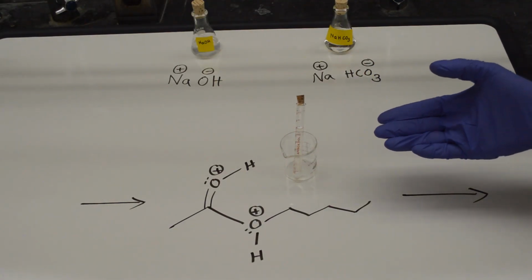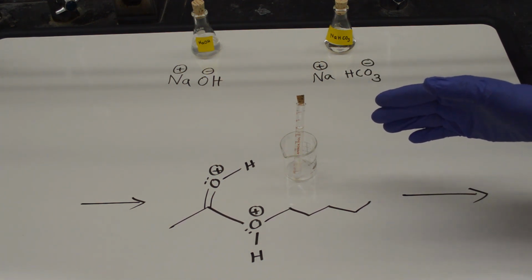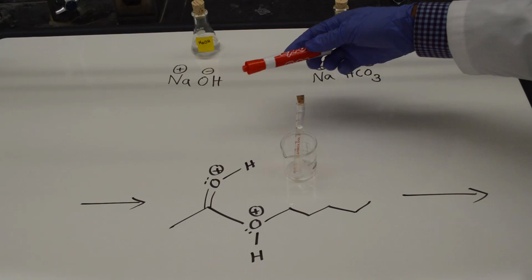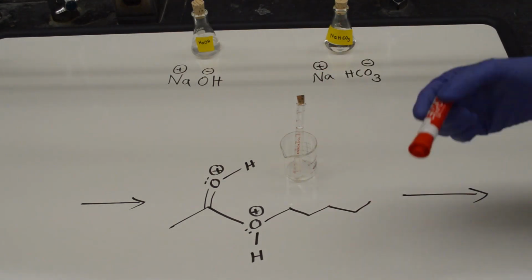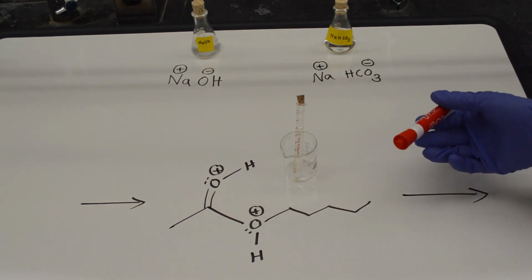This is what I obtained from the reaction flask. It's not the final product. It still has, or it may have, 2 protons on the oxygens. So it's just an intermediate. It's not the final product.